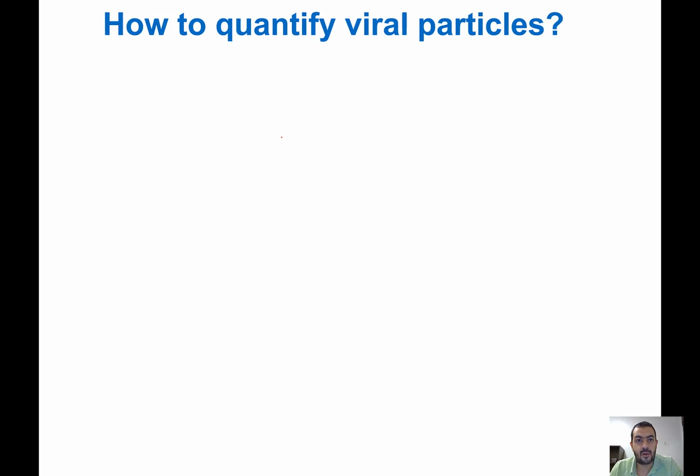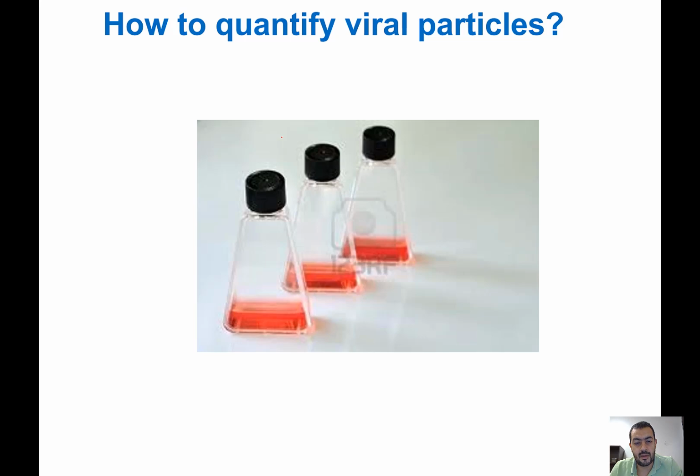So how can we quantify viral particles? Let's say it in the form of a scenario. If you are in the lab and you have three flasks, flask number 1, flask number 2, flask number 3. In this flask you have added 100 microliter of the culture containing the virus.